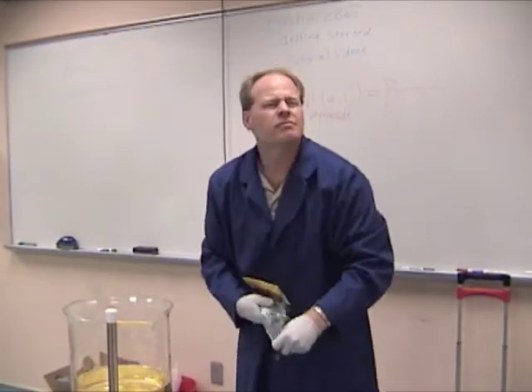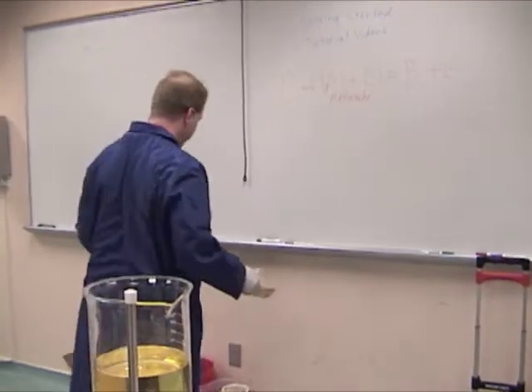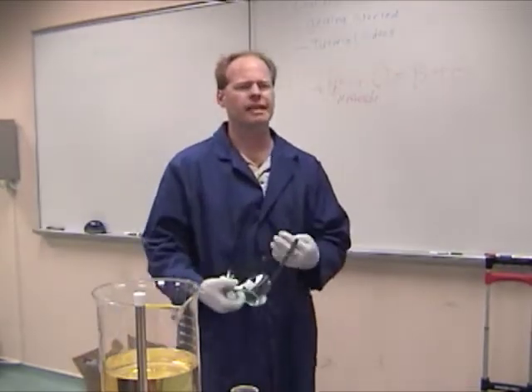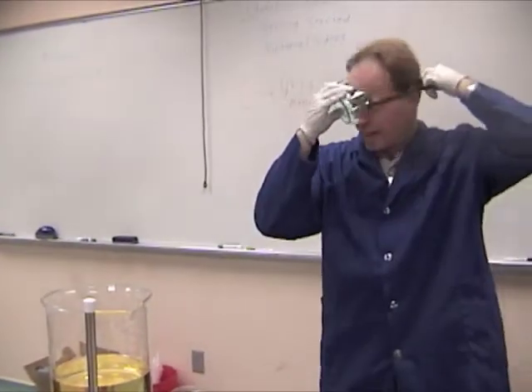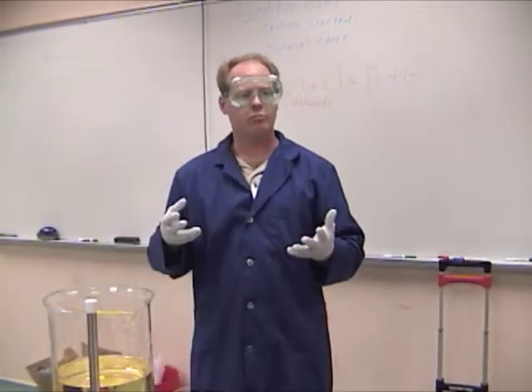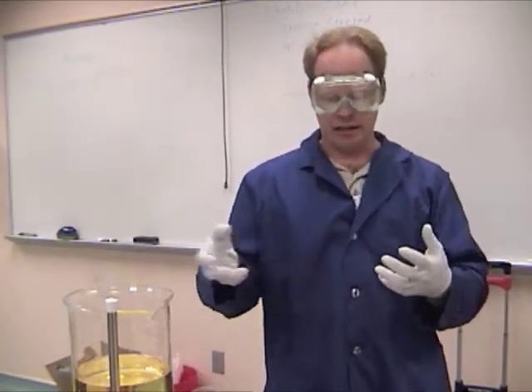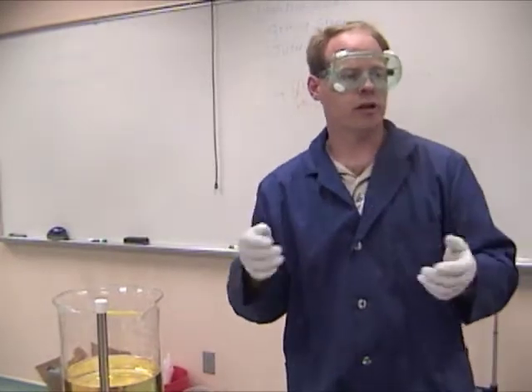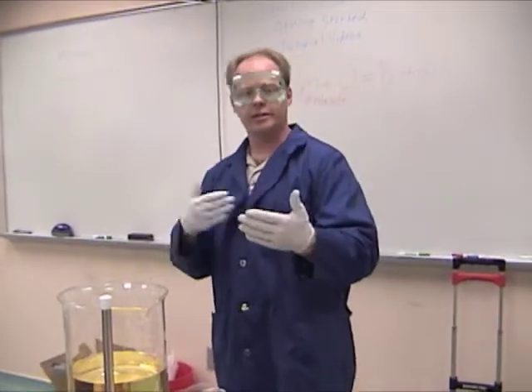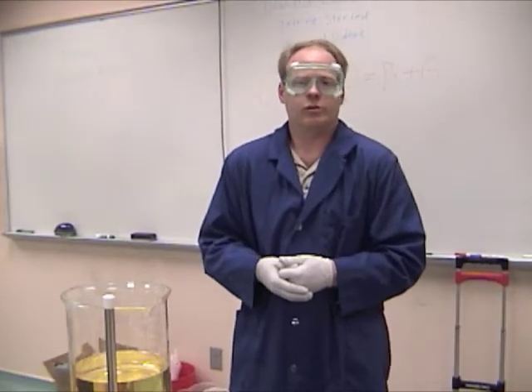In terms of which one is better, potassium hydroxide dissolves better. Both of them will make biodiesel. One of them just dissolves better. The glycerin is a little bit less runny with potassium hydroxide. Sodium hydroxide doesn't boil as violently in warm temperatures. So if your methanol temperature is above about 80 degrees Fahrenheit and you dump a bunch of catalyst in it, it'll really boil. Sodium hydroxide doesn't do that. Well, that's because sodium hydroxide also takes forever to dissolve. It's kind of a give and take. So I personally like to use potassium hydroxide because it's just easier to work with.